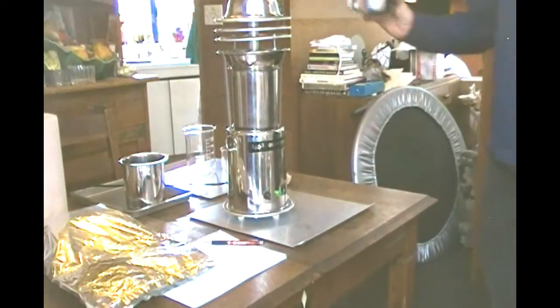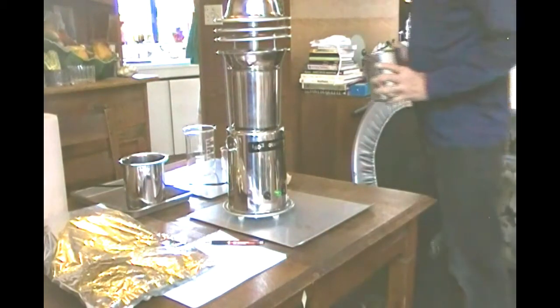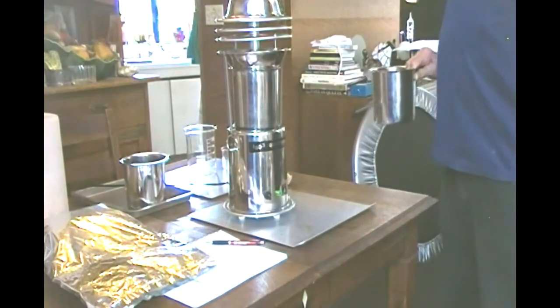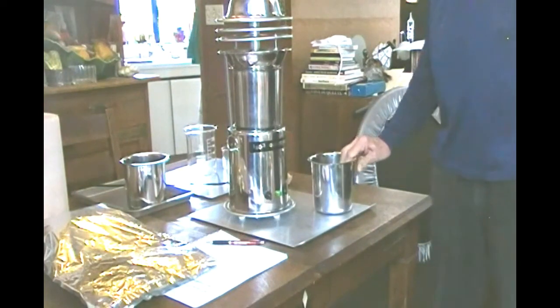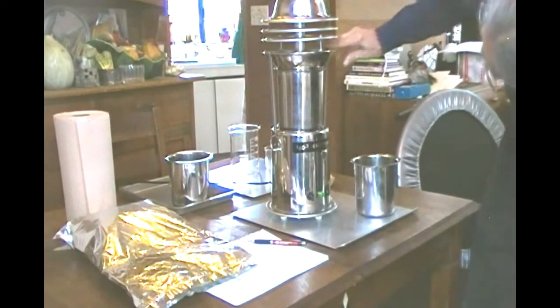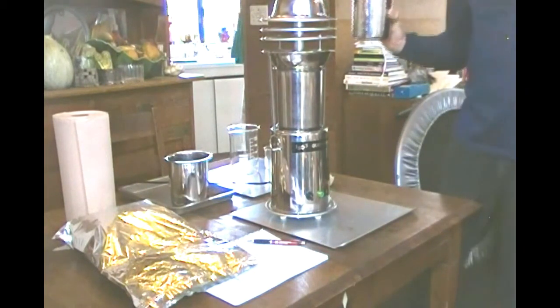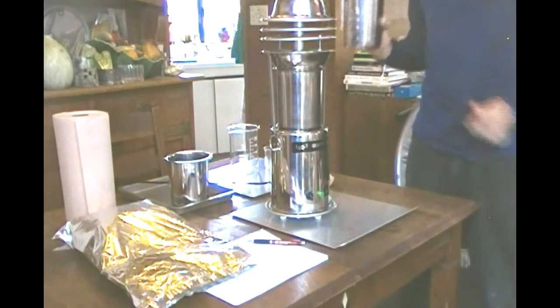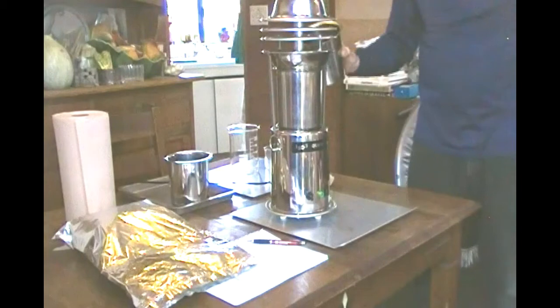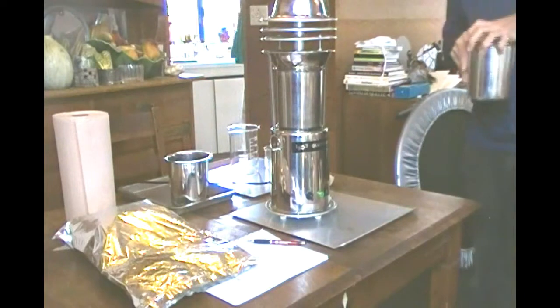We take one of our 1.5 quart vessels, and we're going to put tap water in it. This water doesn't need ice, doesn't need to be cold. Probably shouldn't be hot, but it will warm up while things are in operation. So now we look at the unit, we make sure everything is straight and level. We add water now till there's about 1 inch of water in the condensing unit. This is a very good thing for adding it, and this is better than the beaker because of this lip. Okay, we have about 1 inch of water in it. Next step.